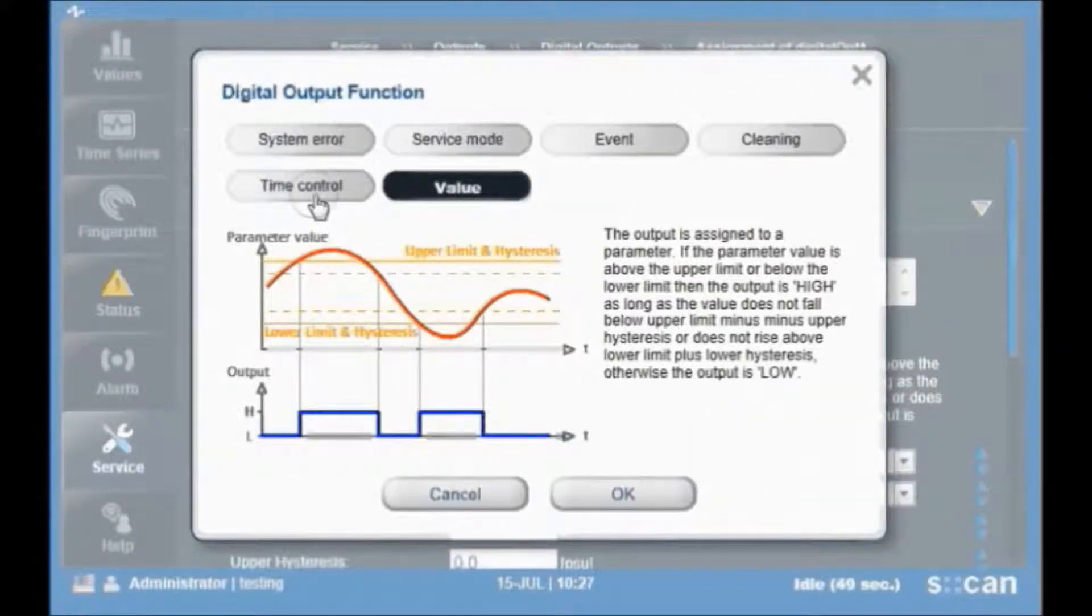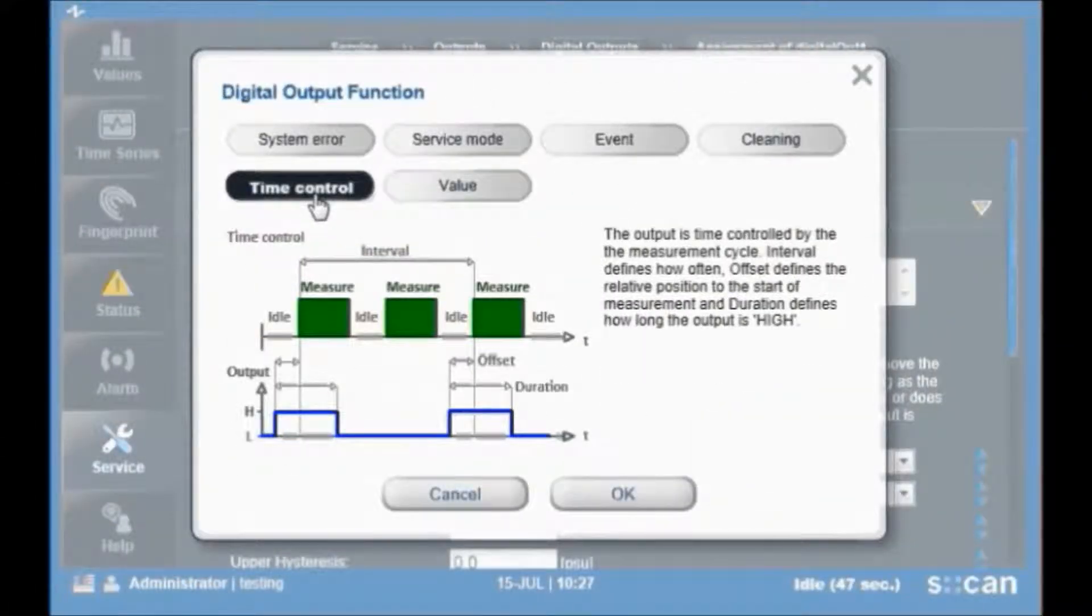Within the digital output assignment settings, the mode time control is available. With the help of this feature, any digital output can be time controlled by the measurement cycle.